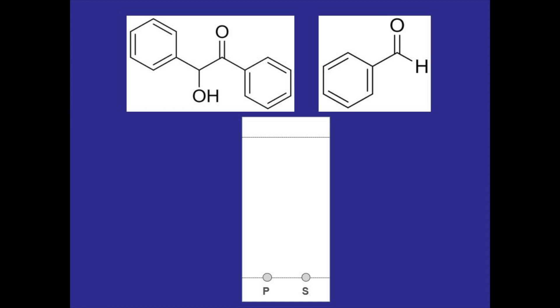So we'll make two spots on the TLC plate, one from the product reaction mixture from the conical vial and the other from a benzoin standard just to make sure that we are forming benzoin and not some other compound.